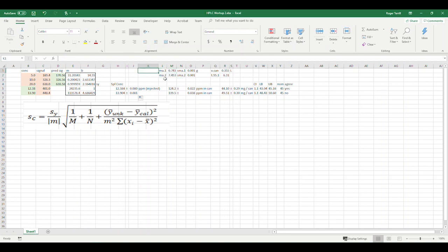So this is specimen mass plus water. And I'm going to justify that guy. And so what we have here is concentration times the ratio of the masses, MA2 divided by MA1, because we're basically going backwards. We've got the result from the instrument, now we're going backwards to the sample, right?